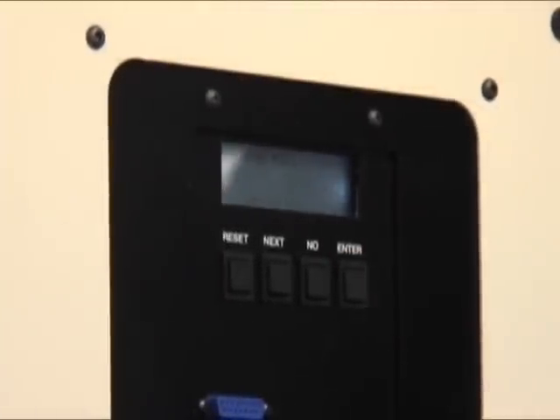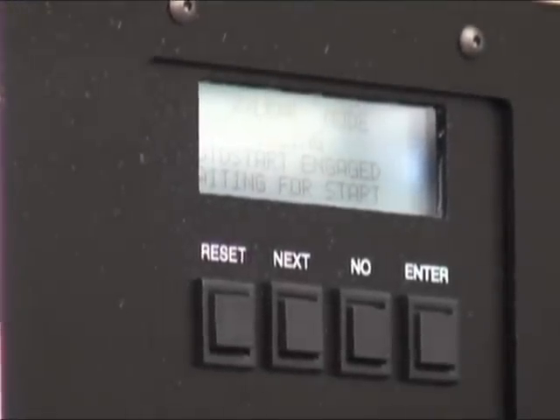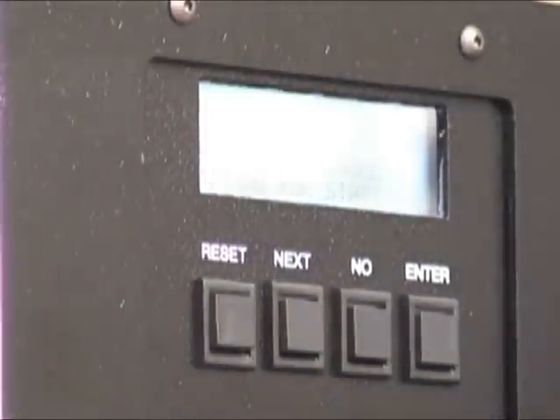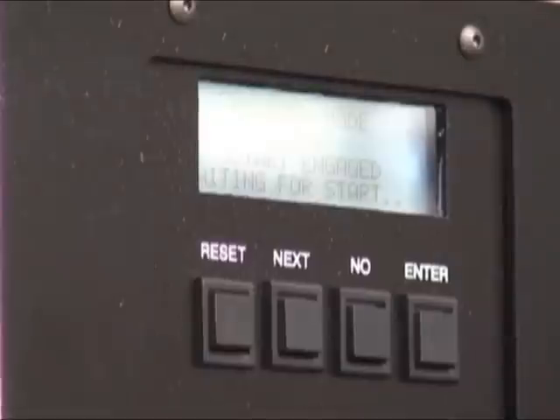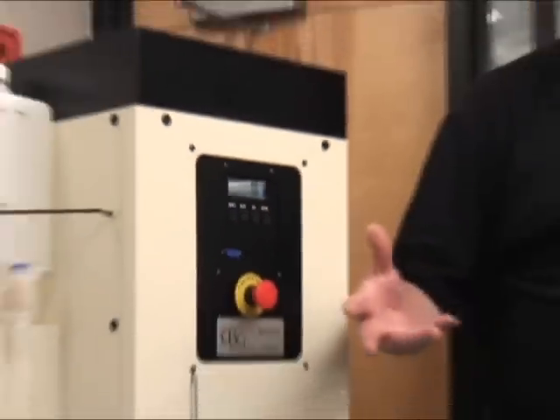Finger, enter. That's it. This is the noise it makes — this is all you're going to hear from this machine. The tone doesn't change. This now runs to total completion. The click you heard is the internal valve, which allows the product to flow through this line and into the tank. Now it's on a filling timer — you essentially walk away from the unit.